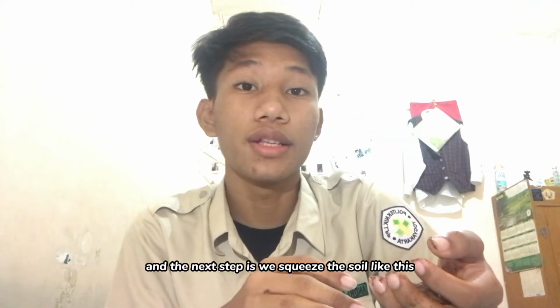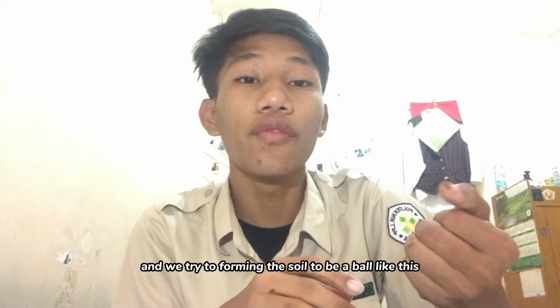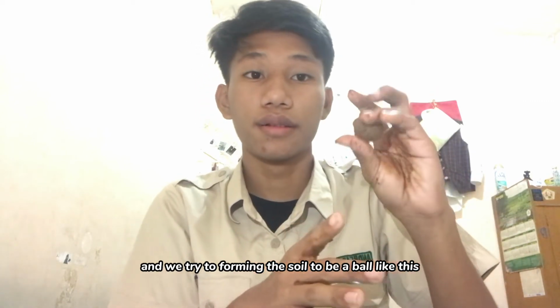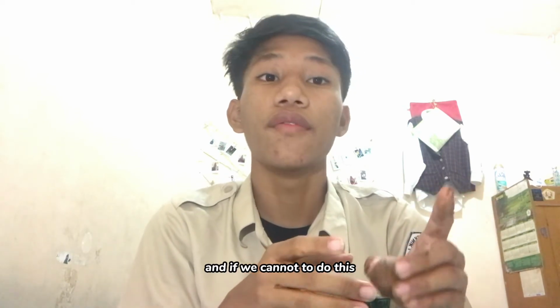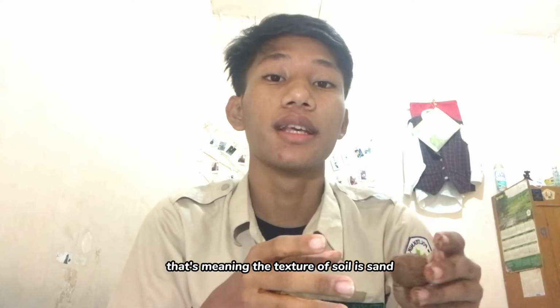And the next step is we squeeze the soil like this, and we try to form the soil into a ball like this. If we can do this, we can go to the next step, and if we cannot do this, that means the texture of soil is sand.